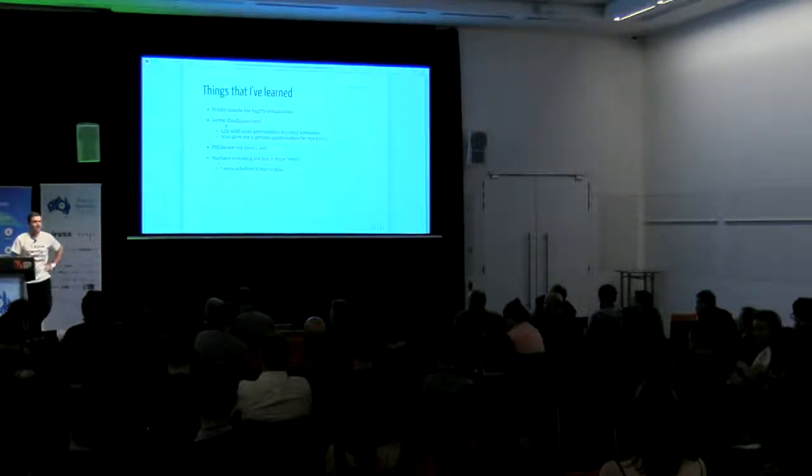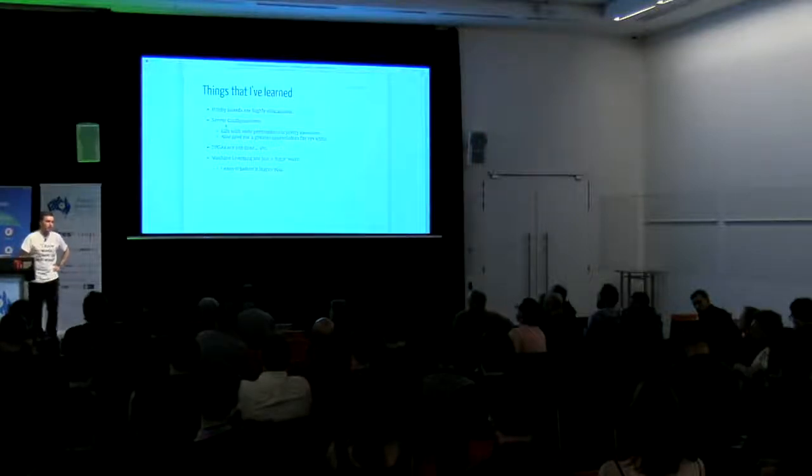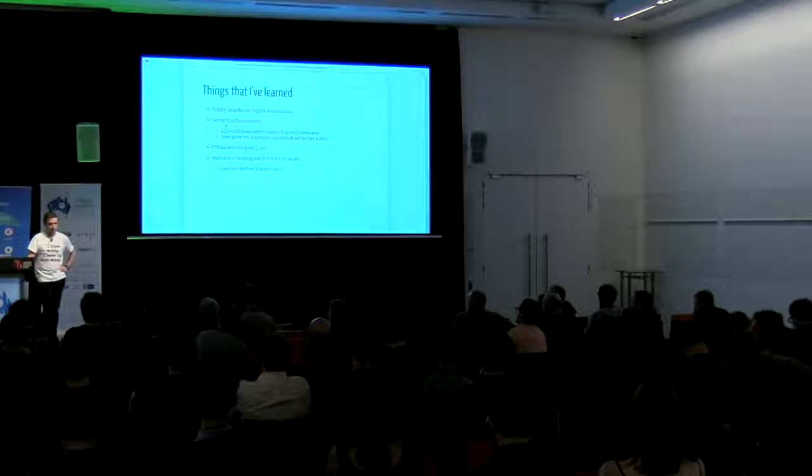Well, the Intel Phis are sort of like a GPU where they give you 64, 100 cores or something like that. And I don't know if they do a portable one, but I know NVIDIA do an embedded kind of GPU product line now. Yeah, definitely. So the current algorithms developed by Oxford Nanopore are somewhat designed for CPUs. It would seem people that have tried them on GPUs have got different outputs. The Phi might work, well, since it's CPUs.